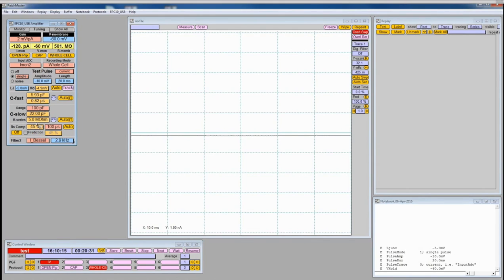I did not make the 80% down here automatic. This is something you should only do manually, in my opinion, because you want to make sure that in this specific recording configuration that you now just established, it is good enough to allow you to compensate 80%. So you should have a look at it before you actually go here and set this to 80. Okay, that's it. Now we can get started with the recording.